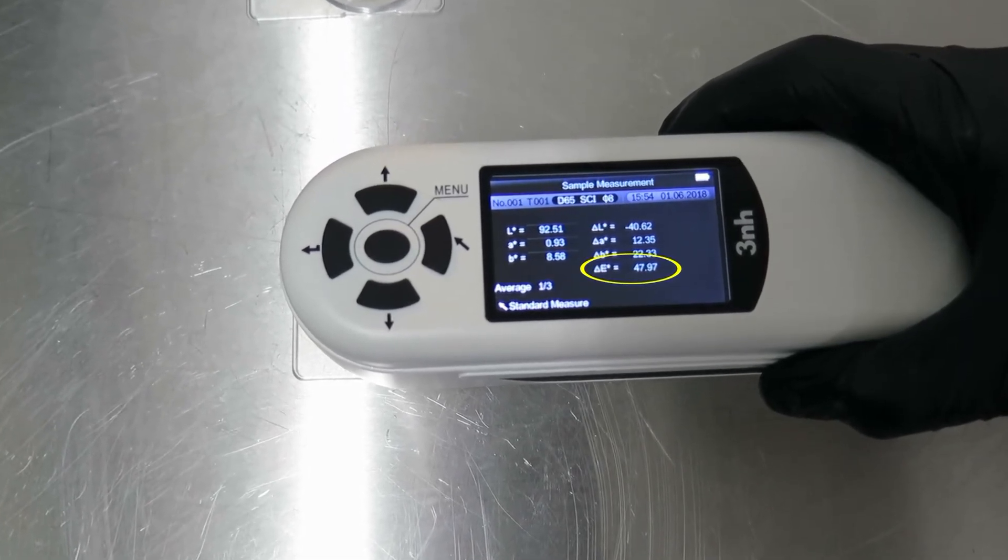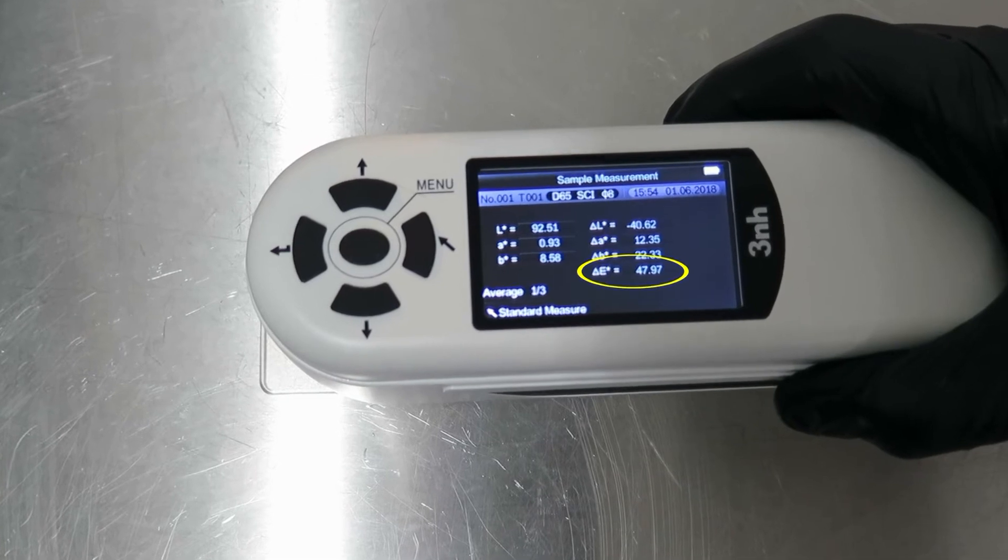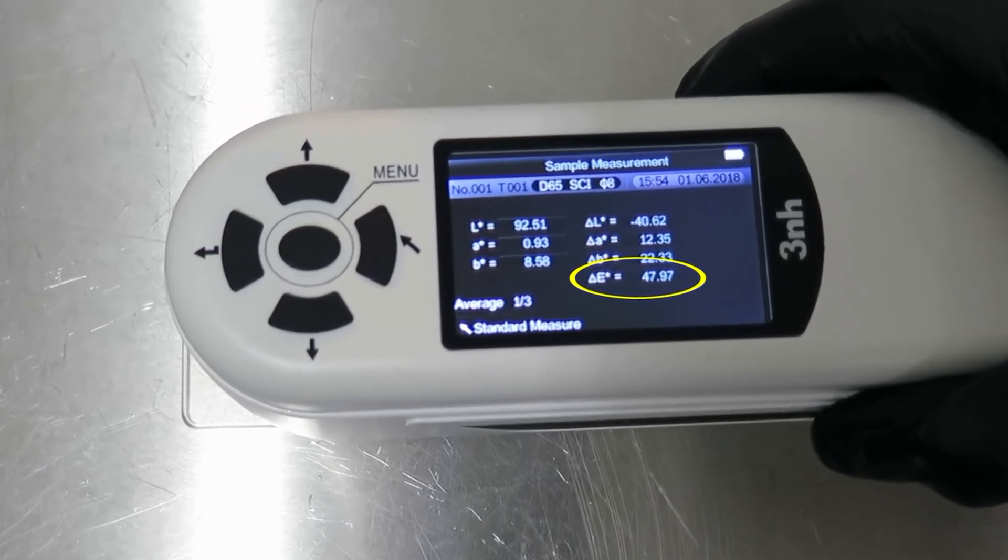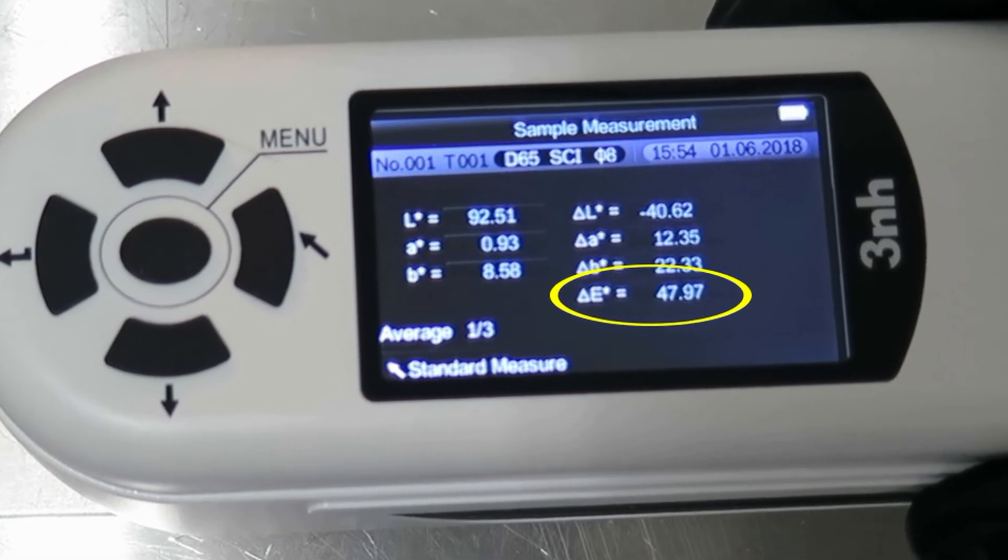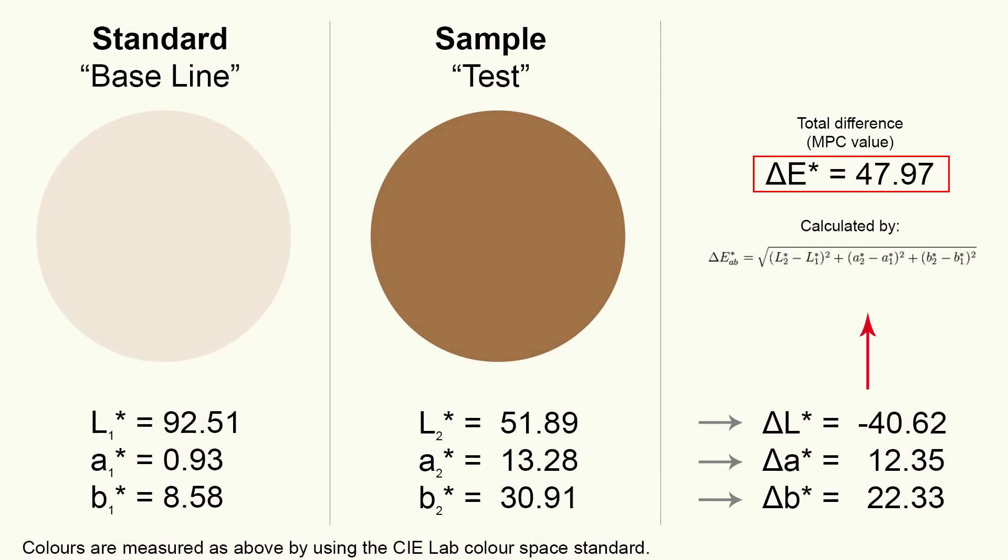The delta E value shown is the color difference between the new and the used oil samples. This delta E value is the MPC value. Delta E describes the difference in color between new and aged oil. This allows us to record and track chemical degradation through the buildup of varnish. We can also measure improvement in the oil condition through the removal of varnish.